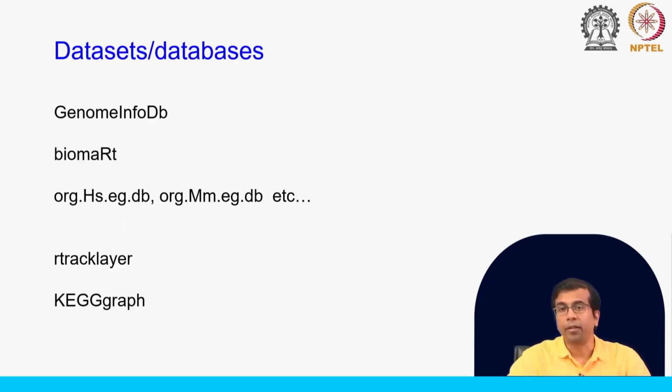We can also have databases or database connectors that could be useful. For example, we have GenomeInfoDb, we have biomaRt, and then you have these packages, organism org.Hs.eg.db.